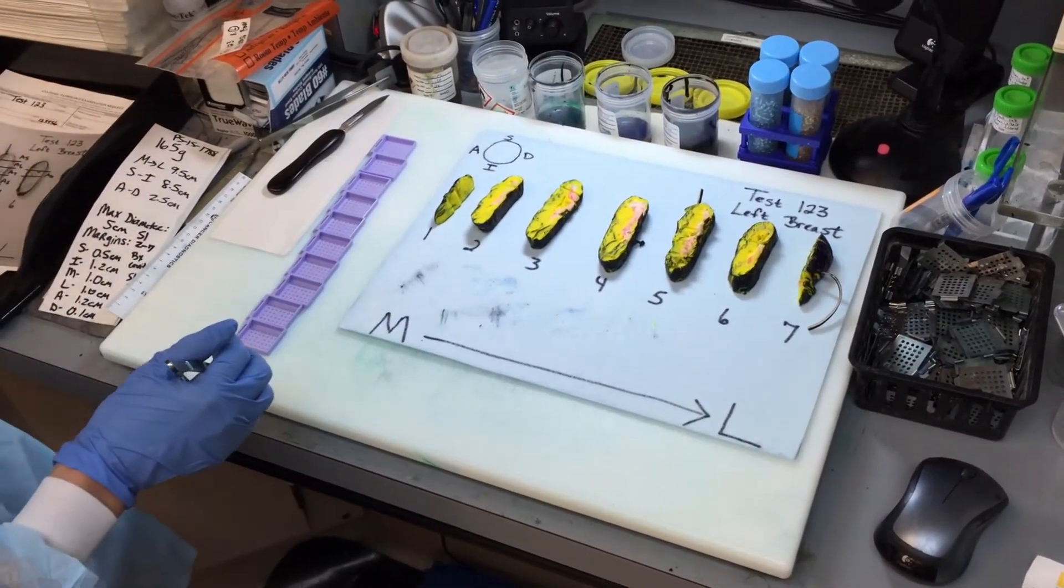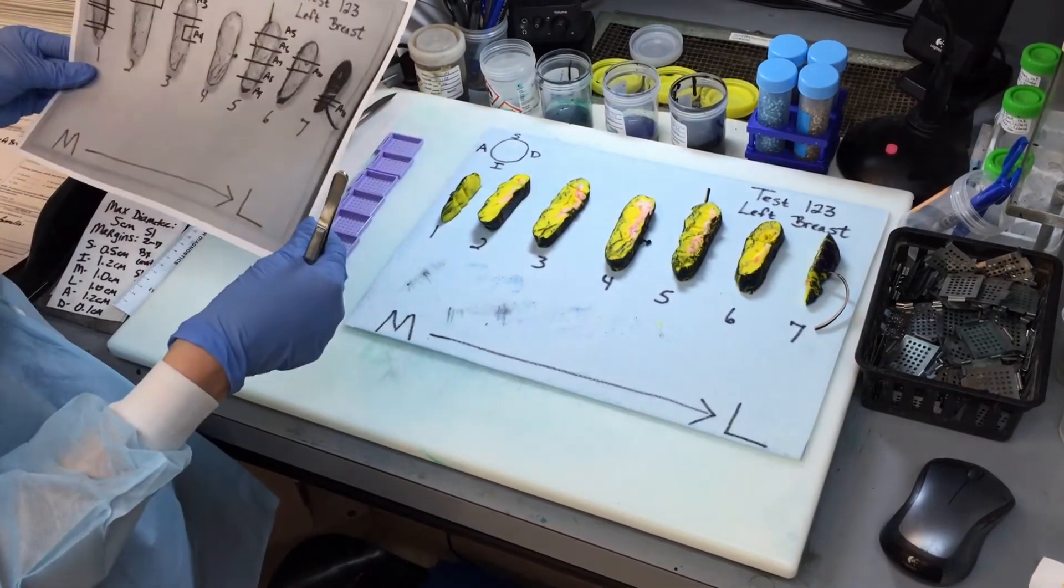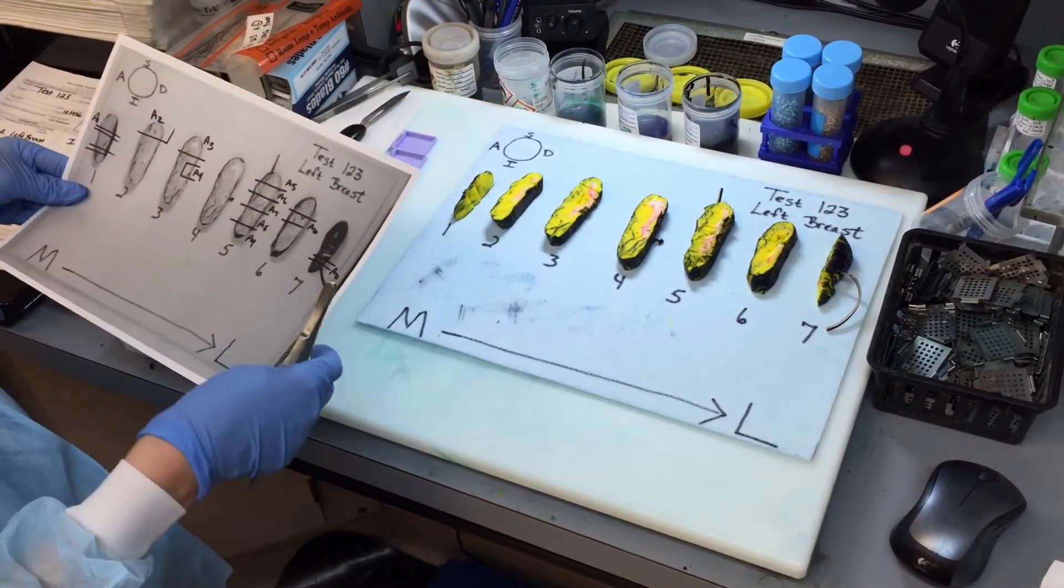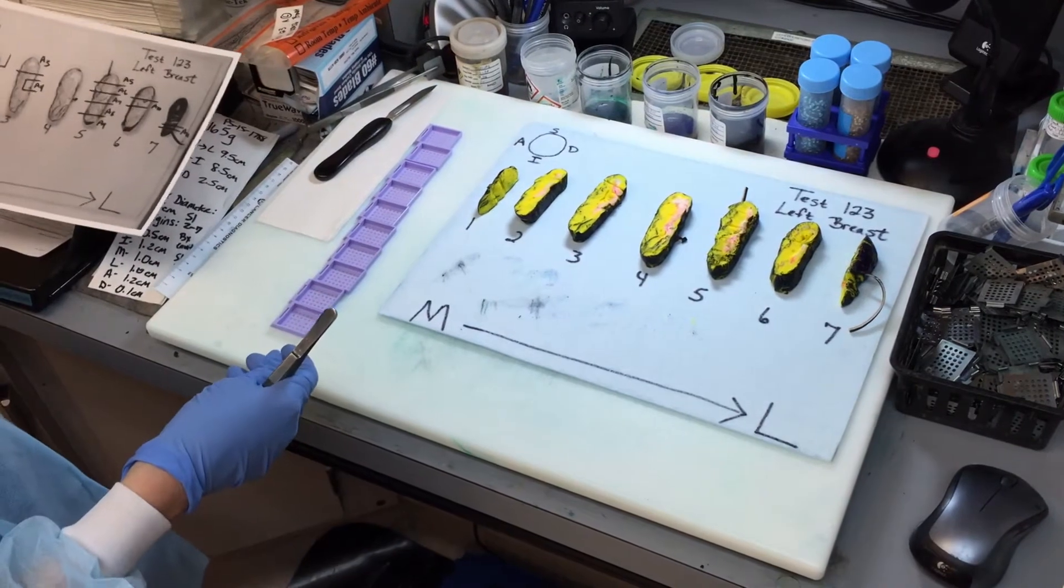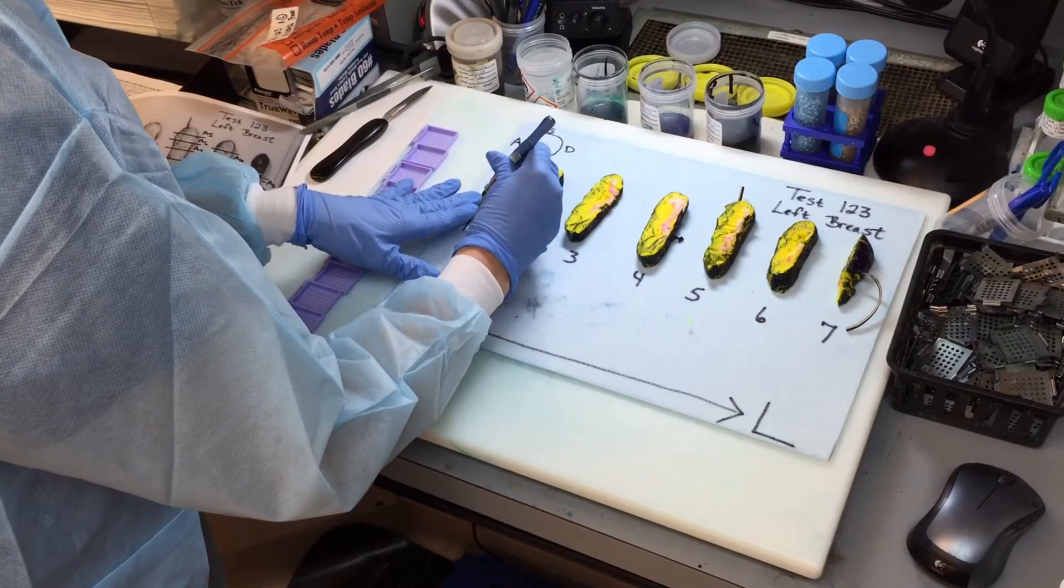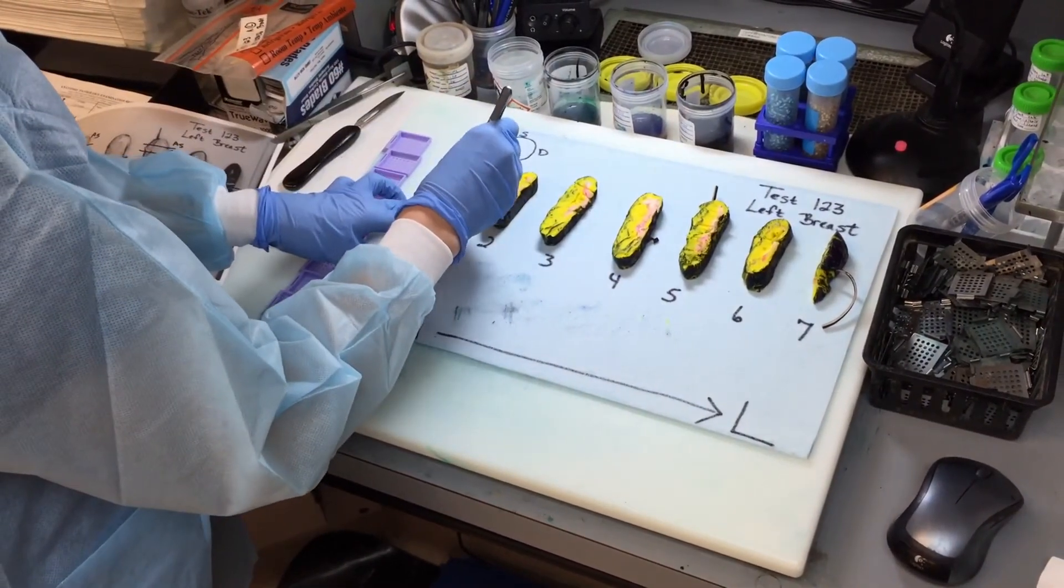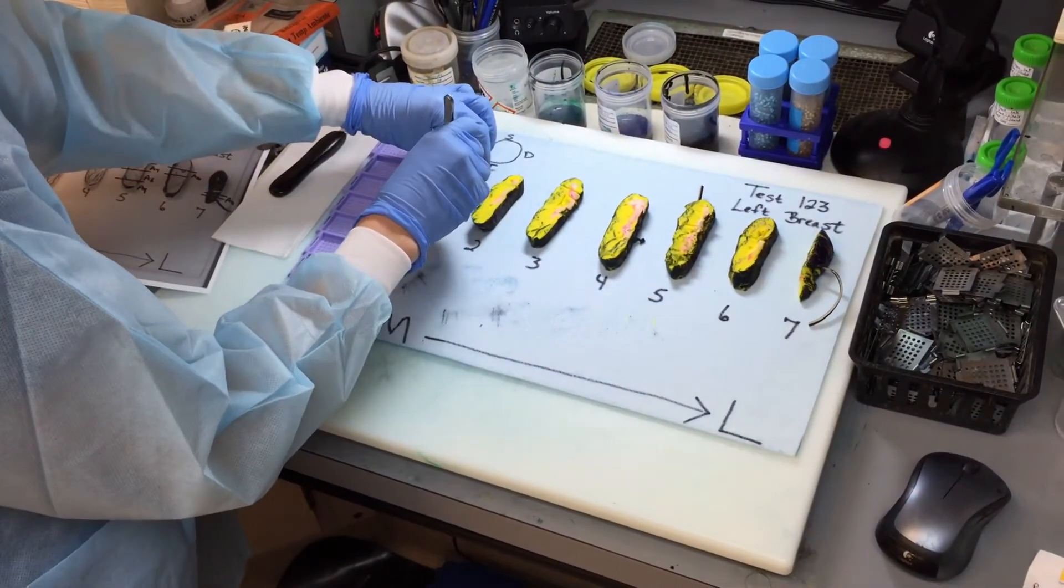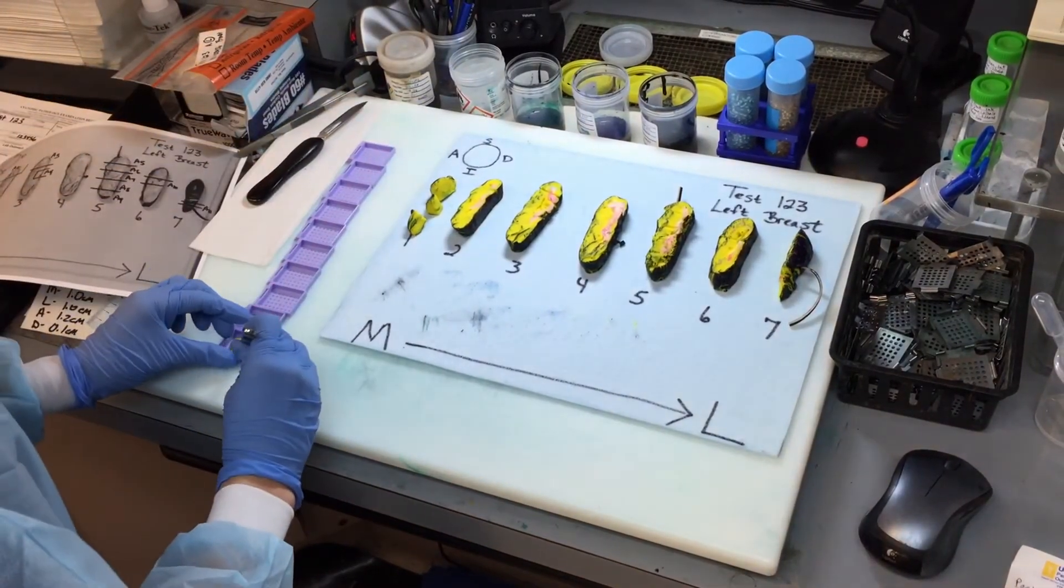So I've printed out two sheets of the picture we've taken and one of them is to use while you're grossing. So you can get it dirty and then the second sheet is to transfer to the clean copy that will go with the requisition and to the attendings. So on slice one, we've made a couple of perpendicular sections and these representative perpendicular sections in slice number one will go into the same cap, which is the medial margin.